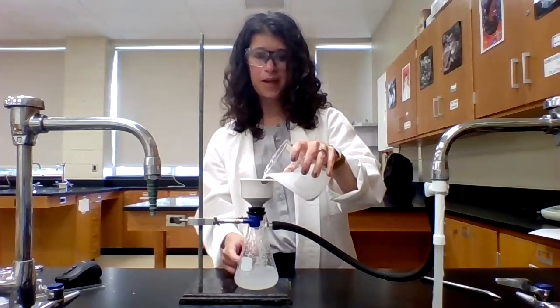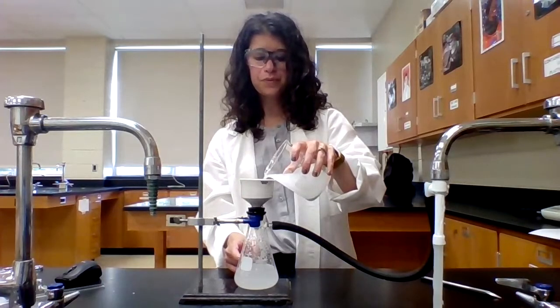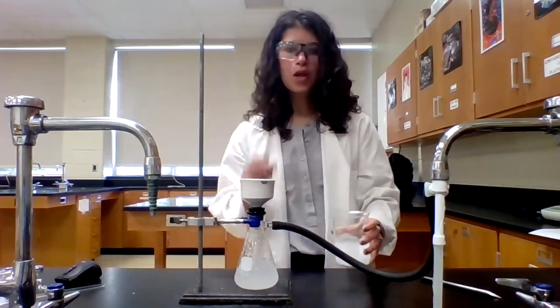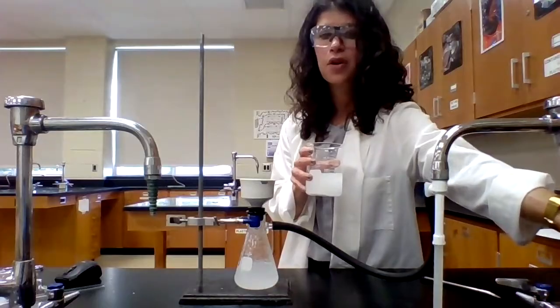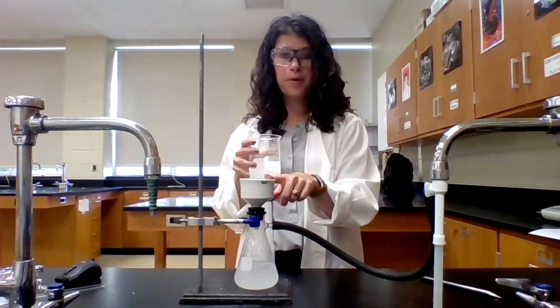So I'm just kind of keeping an eye on the liquid level here. So what I'm going to do is I'm going to completely filter all of this, making sure that any solid at the bottom, that's my product, that's the calcium carbonate, I need to transfer all of this solid onto this piece of filter paper. Okay, so that's what I'm going to do now.